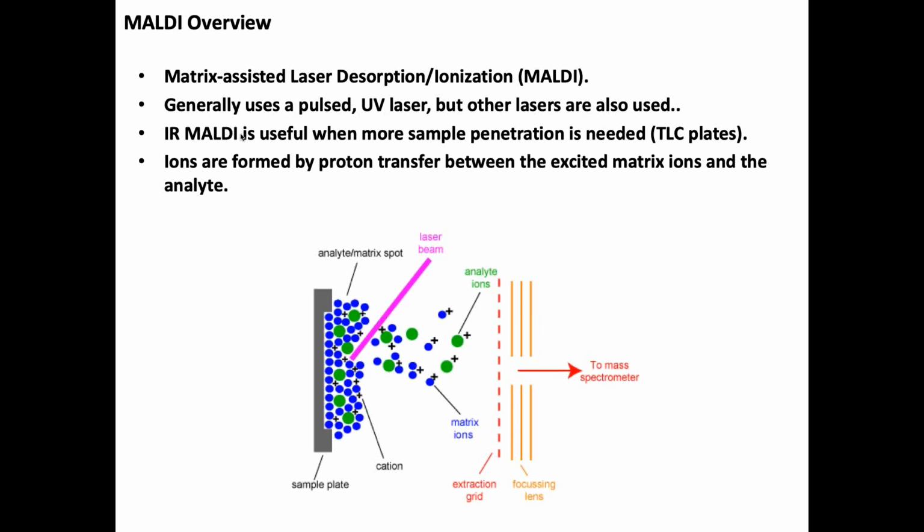So you get this thermal expansion, and because you've also biased it, you've got this charge on it, and all of the matrix molecules start to sublime. They evaporate off of the encased sample. And as soon as you get to the grid, where you extract and accelerate those ions to a kilovolt or more of energy, that is exactly right.